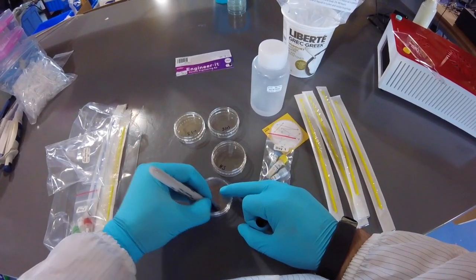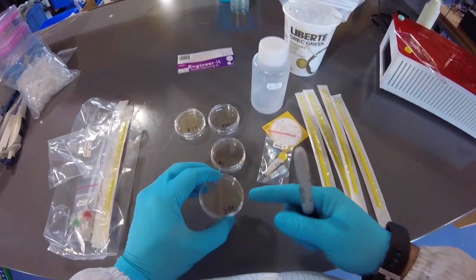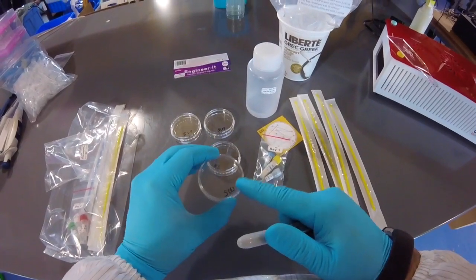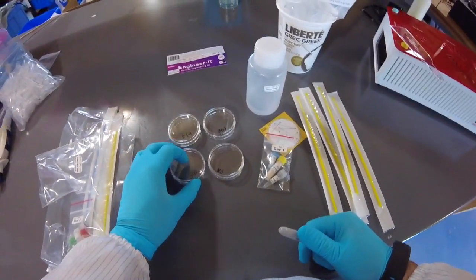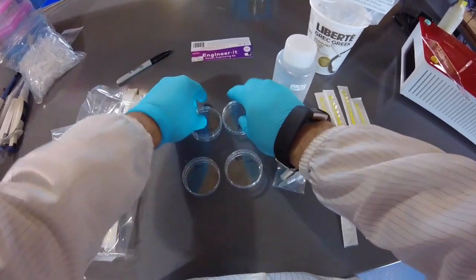And lastly, we've got the S, and we're going to put an E next to that for experimental. All right, and this is the selective plate, which we're putting our experimental sample in. So this is going to be our engineered cells. Hopefully we'll see some nice colorful colonies on this in a couple of days, okay? All right, so we've labeled our plates. That's pretty important. So they're ready.